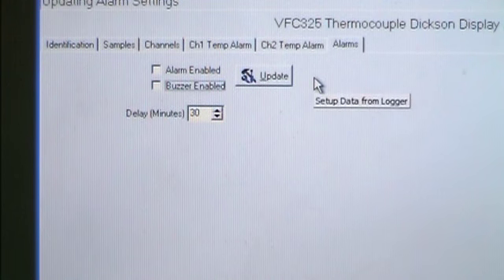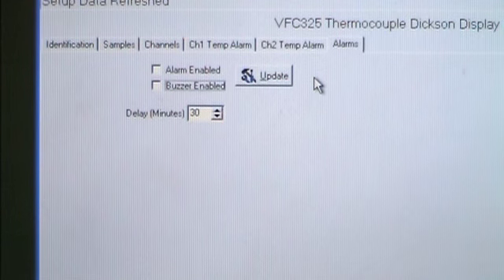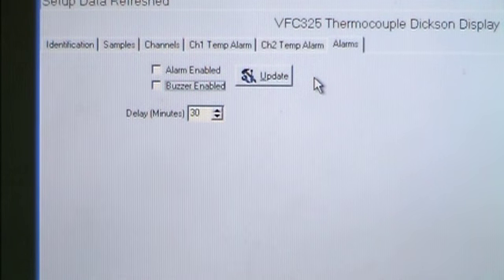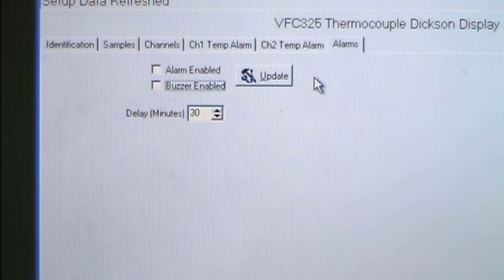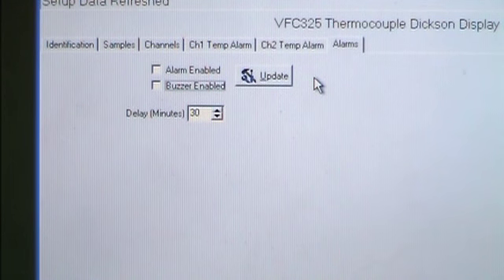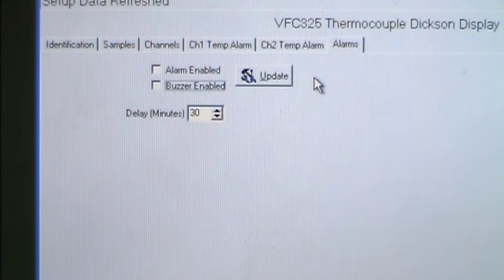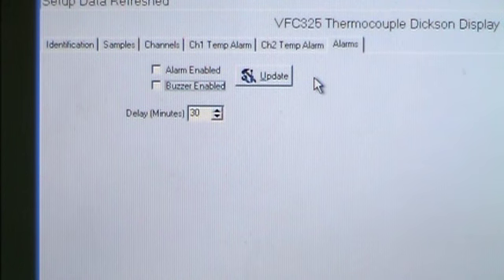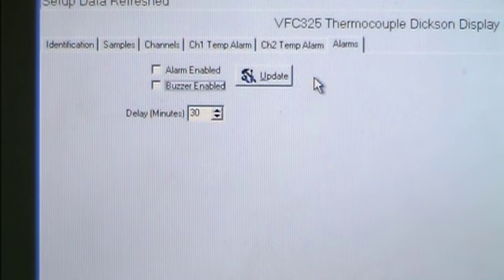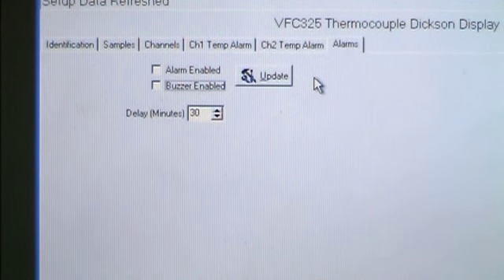The words 'Setup Data Refreshed' will appear when completed. The logger is now sampling and ready for use. Remove the cable from your PC and the logger. A delta or triangle symbol will appear on the display to confirm that the unit is logging. The logger will log ambient temperatures until you position the probes inside the refrigerator or freezer. Account for this movement when evaluating your downloaded data.